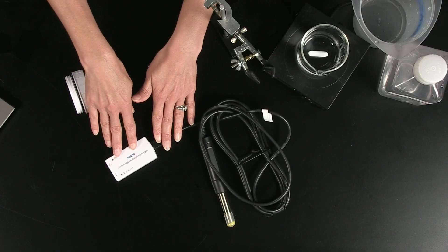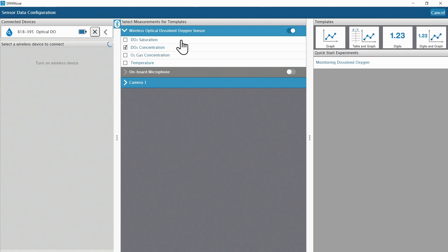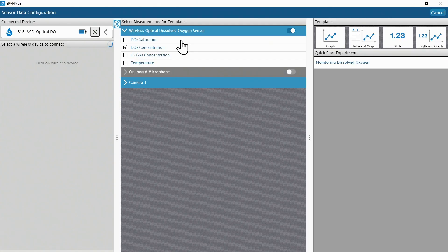I've already connected my wireless ODO sensor to SparkView, but the sensor is also compatible with ChemView and Capstone software. You can see the sensor has two measurements for aqueous solutions, one measurement for air, and a temperature measurement for either air or aqueous solutions.